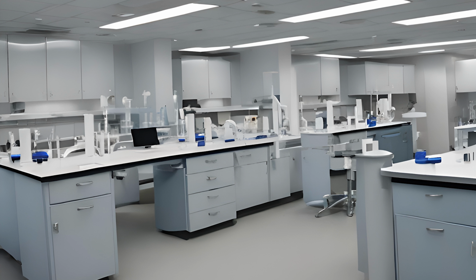Each SDS must give the product's identity as it appears on the container label and the chemical and common names of the hazardous components. They will also provide information on spill and disposal procedures and what PPE you need to wear when you're handling that chemical.